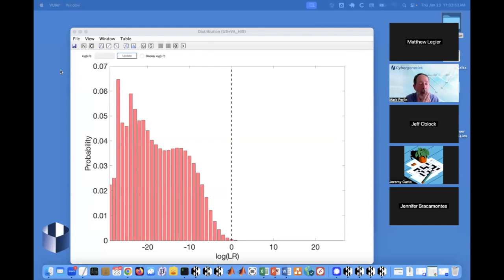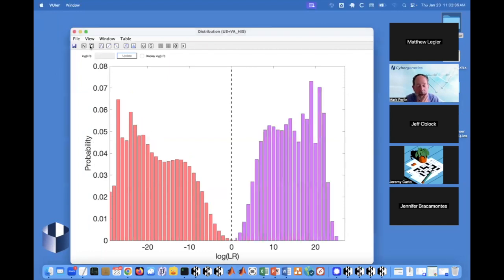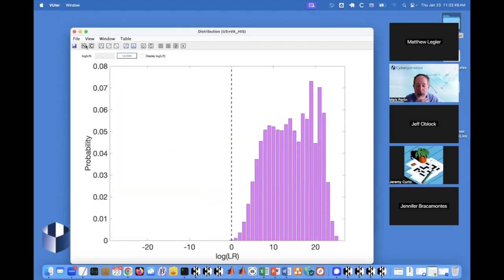But at a click of a button, Matt, that is the contributor distribution. That's what it is. And it's built in. And the reason you want the contributor distribution, you can turn off the left one, is because now you can do exactly the same work for not just understanding the sensitivity, but for calculating specificity for exclusions.